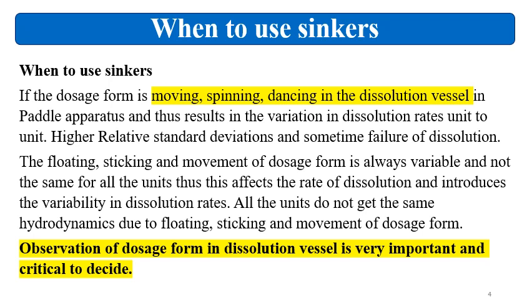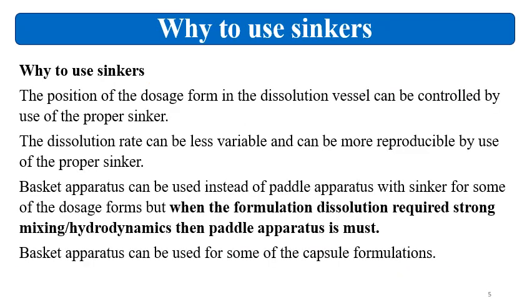So observation of the dosage form in the dissolution vessel is very important, and it is very critical to decide on the use of sinkers. So whenever formulation development is done, at that time the dissolution should be observed critically so that the use of sinkers can be justified. Then the position of the dosage form in the dissolution vessel can be controlled by the proper sinker. The dissolution rate can be less variable and more reproducible by use of the proper sinker.